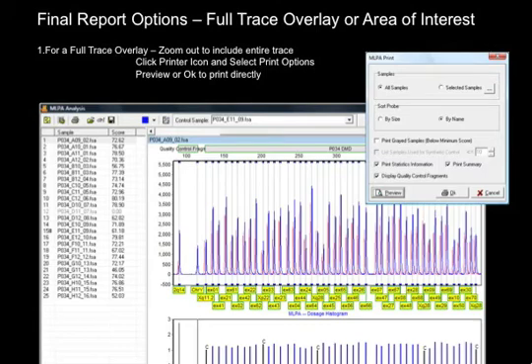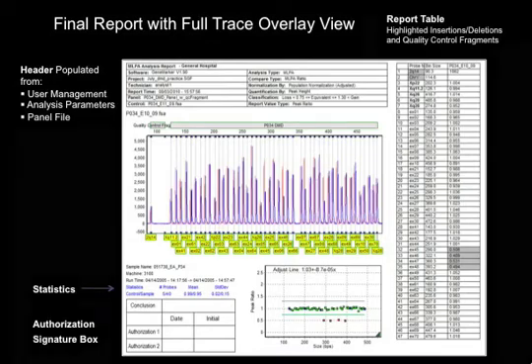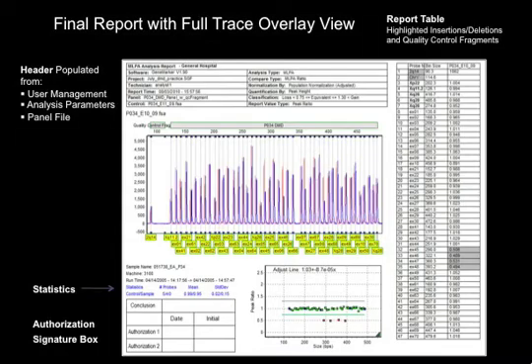Display quality control fragments will list and highlight the quality control fragments in the report table. The final report includes a header, trace overlay, report table, sample statistics, peak ratio plot, and a conclusion footer for authorization date and initials. The header obtains institution name and technician from the user management, and all other information from the project settings used in the analysis of the data.